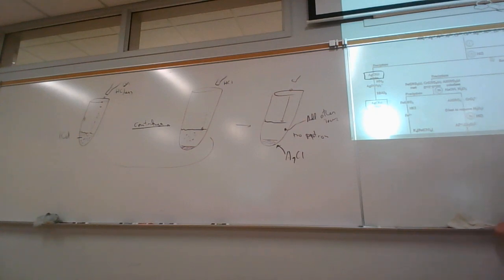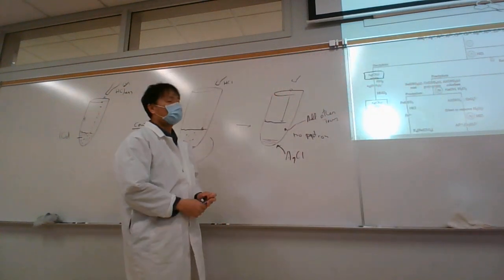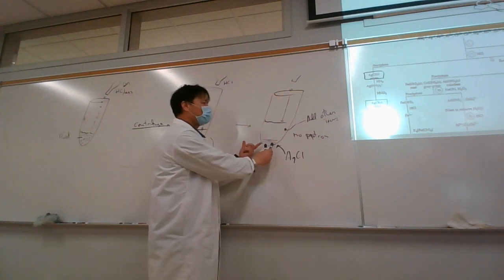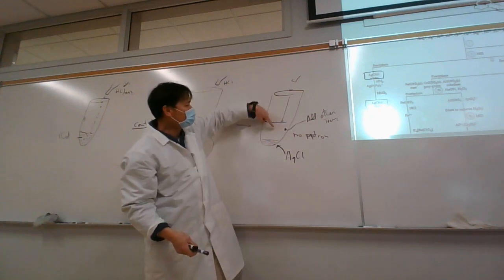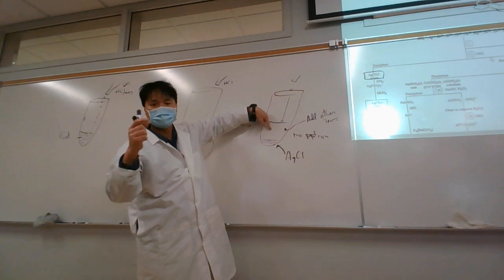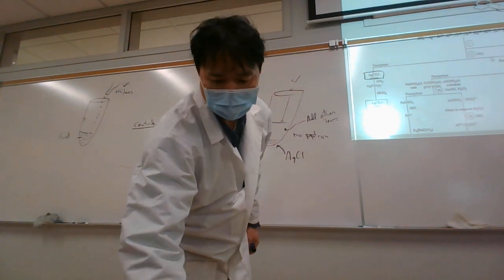And the way we separate this, there are two techniques that are commonly used. One technique is just to decant it, but if your precipitate isn't well compact, then decanting it could lead to some precipitate flowing over. The other technique is to pipette it. So you get a plastic pipette, one of the long ones.